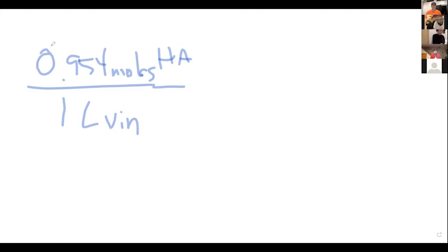Okay, yep, I'm following you. So then, what did you get for a concentration? Molar concentration. 0.95, and I think I cut off one, it was the 4. Okay, yeah, that's fine to report that. But then when you're doing the calculation, you can carry more digits through.